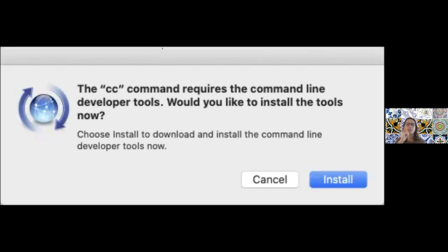When did you get this message? When you open? I tried to change the background to zero, the value. Oh, at that point. That's not related to the fit. That's a program issue. I would recommend restarting the program. Okay, thank you. I don't know how far you had gone, but if you saved your project, you can reopen it afterwards. Okay. Now this looks like a bug.